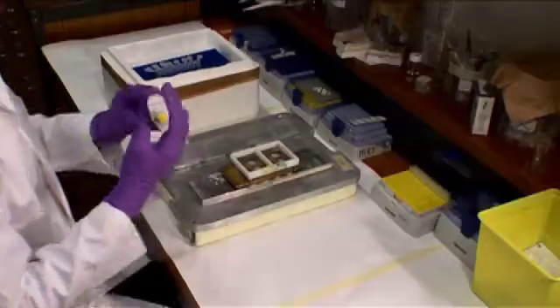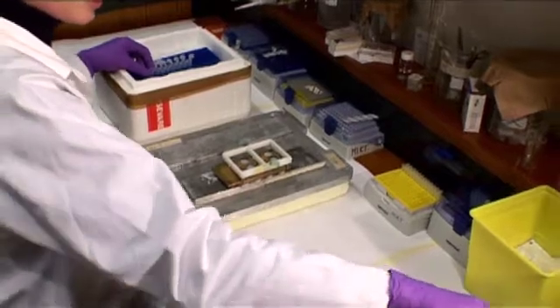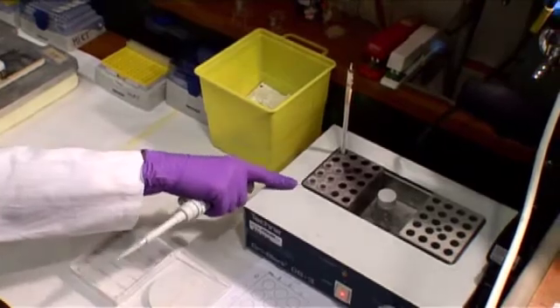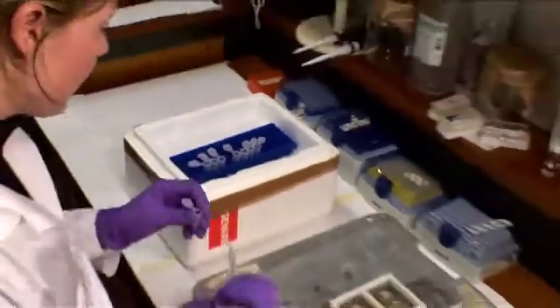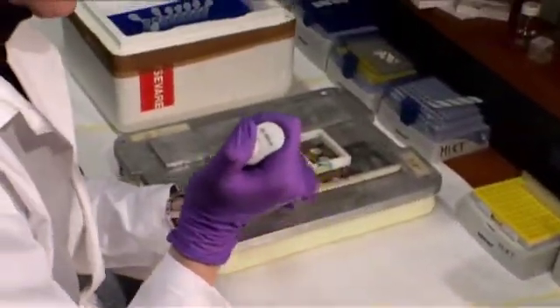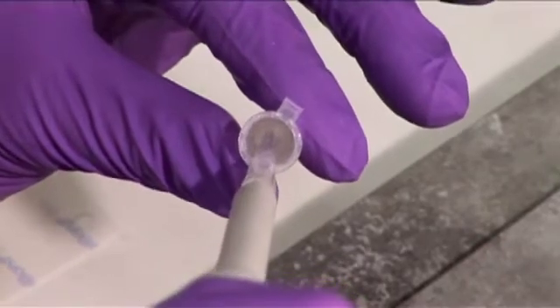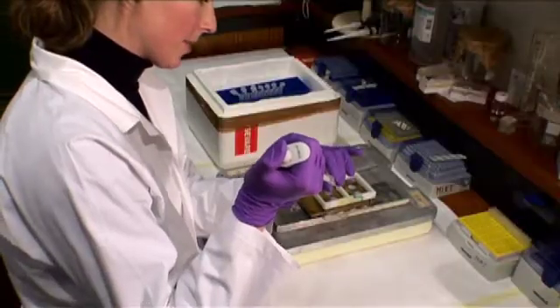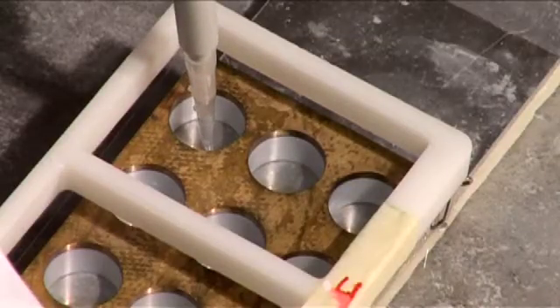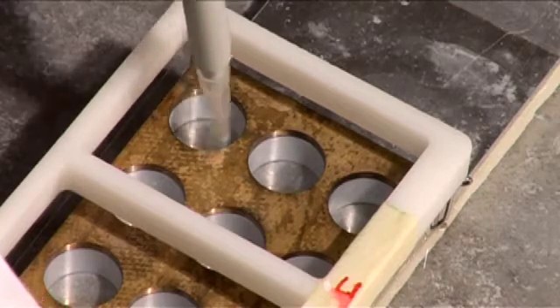like this. Then I will transfer the sample over to the agarose gel, which is here on the 37-degree incubator. And mix thoroughly, but careful. I will transfer 60 microliter of the sample agarose mix to each well. I start in the middle and then I streak carefully out to the edges.